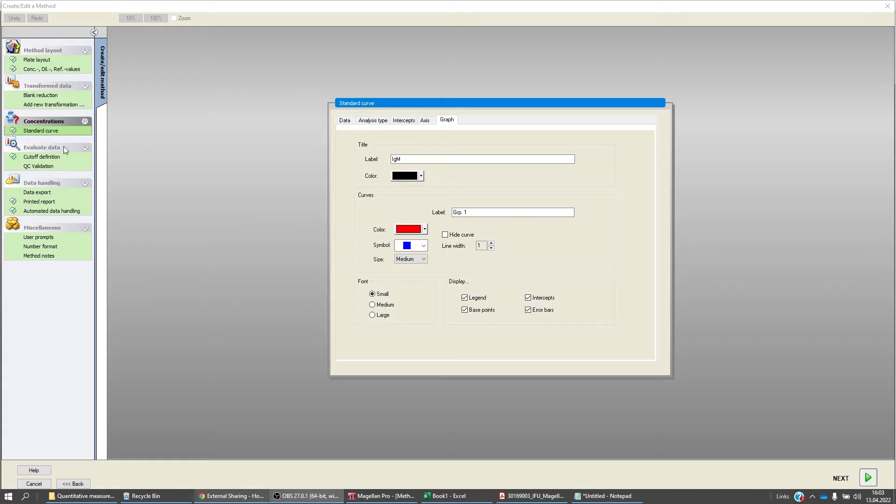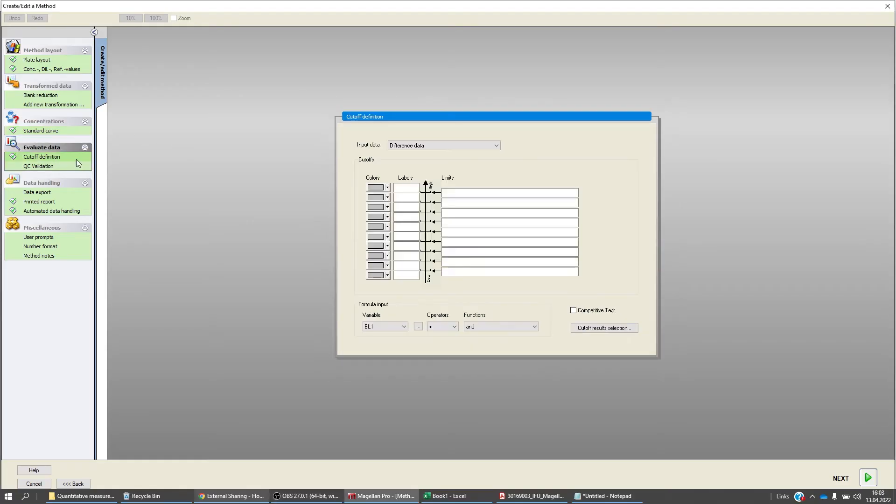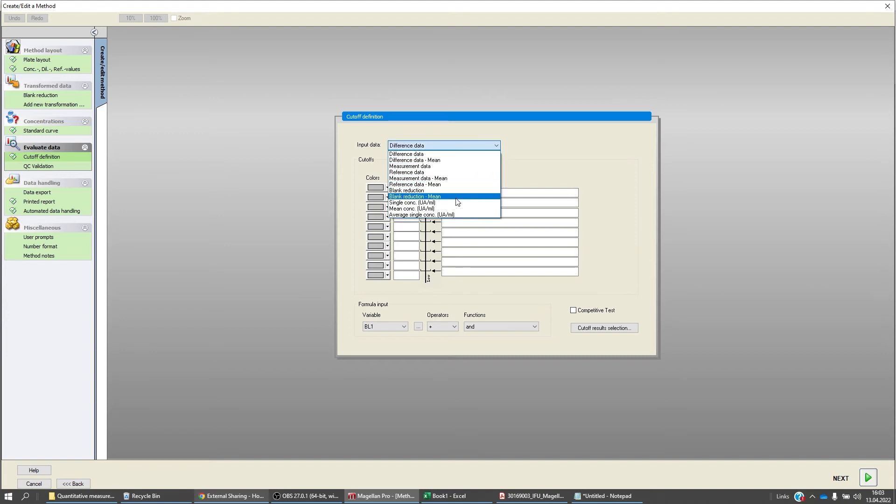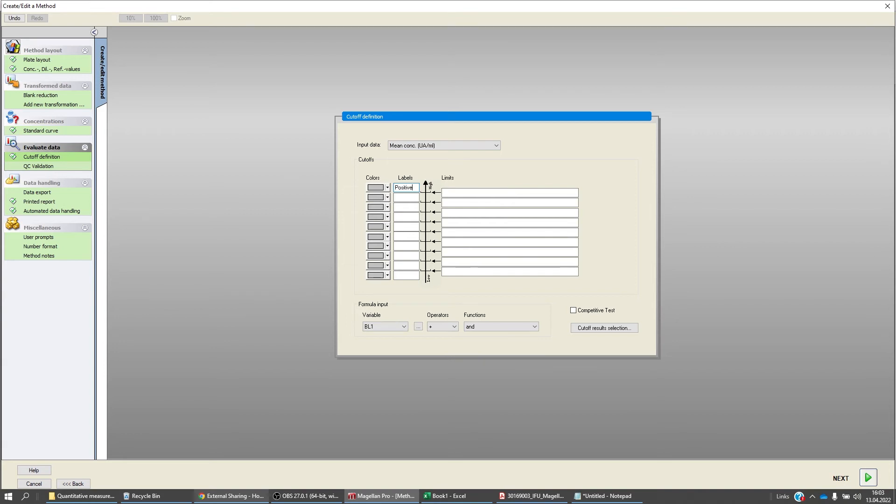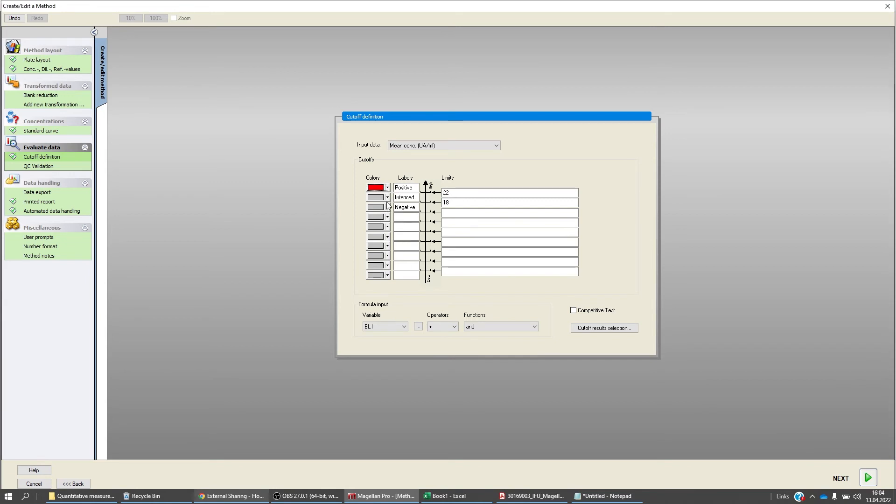Your assay might require a cut-off definition to discriminate between positive, intermediate, and negative results. Select the desired input data and simply type in the cut-off value. You can define colors to easily discriminate between different labels.